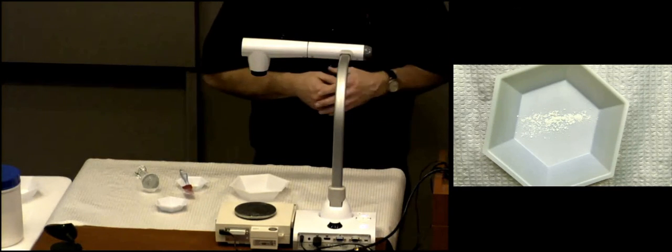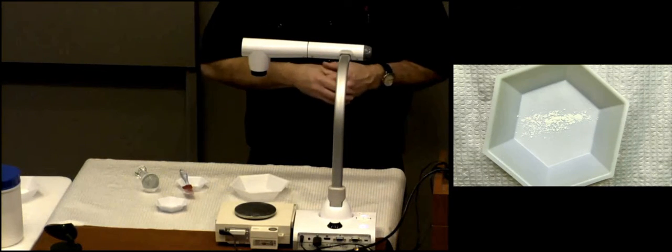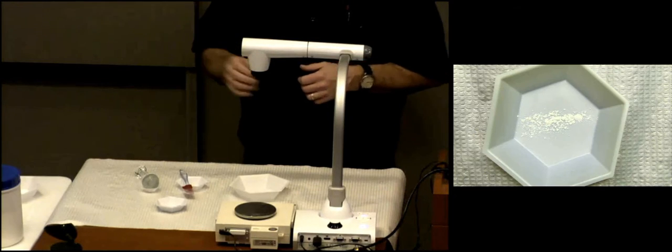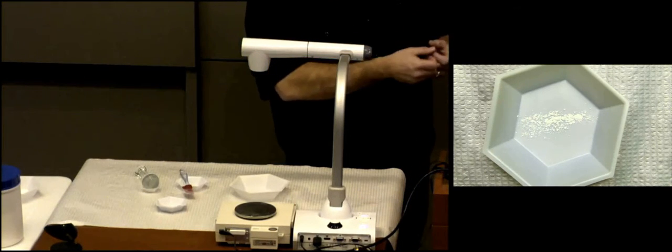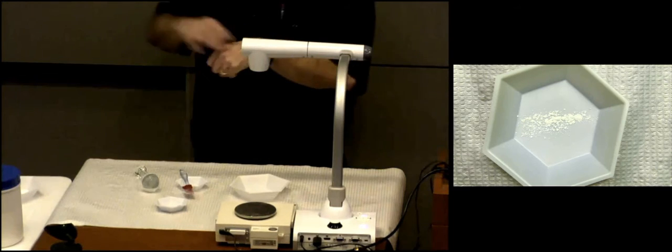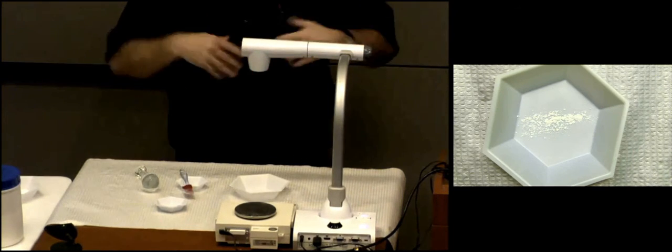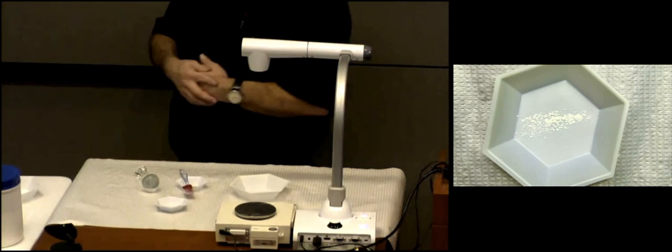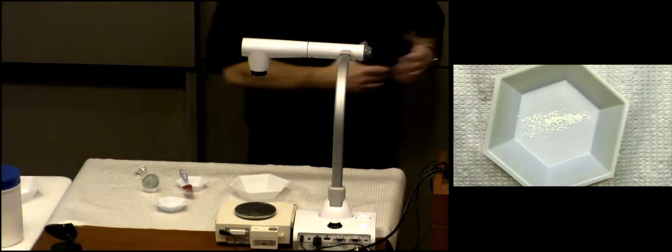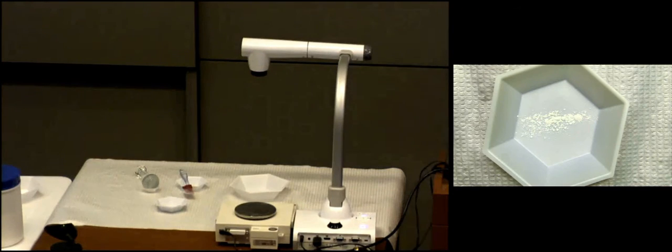Why free-flowing? Because coming out of that shaker bottle, did it shake out when she shook it? But remember, if yours, especially when you start initially, is clumpy, if it's damp or clumpy, it's not going to spread on the skin. It wouldn't come out of the shaker bottle. That would not be a good product. Ours is a free-flowing powder that can shake easily out of its container. So that's a good product. So we want to describe it that way. Okay? Yeah? What are your words to describe?